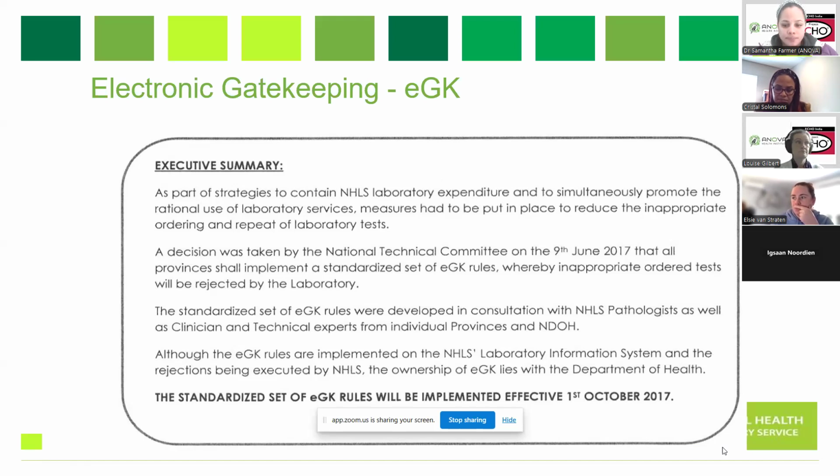So the time period for a viral load is that you can ask for it today and you can ask for it again in 3 months' time. If you ask for it before the 3 months' time, we are going to reject it. And it's an electronic gatekeeping. There's nobody there making a decision. Our LIS, lab information system, looks at the date we received one today, and we look at when on this patient with this folder number and so on and so forth.